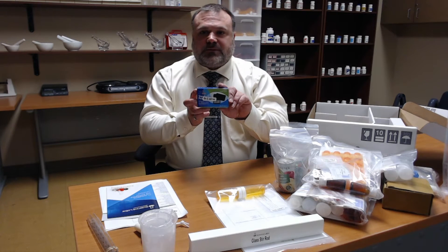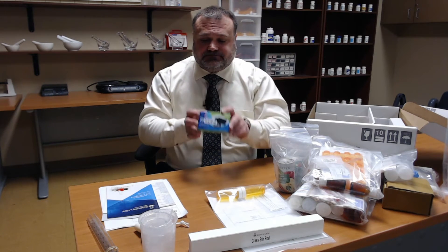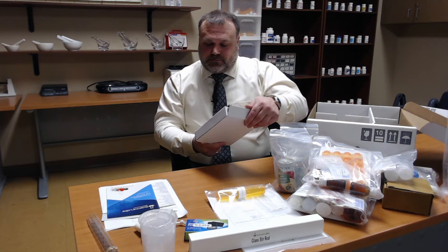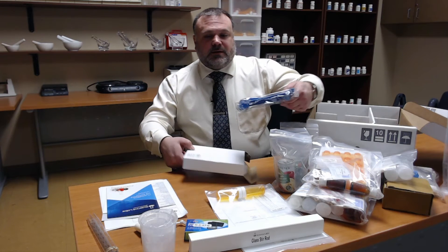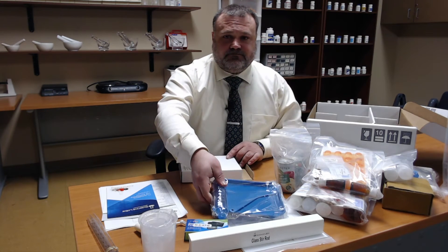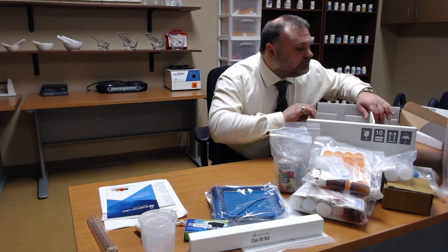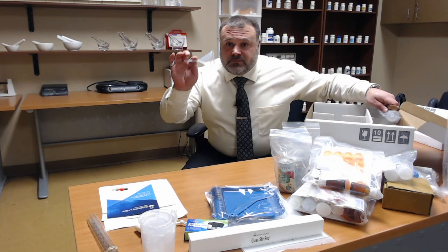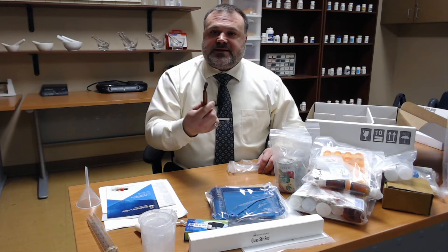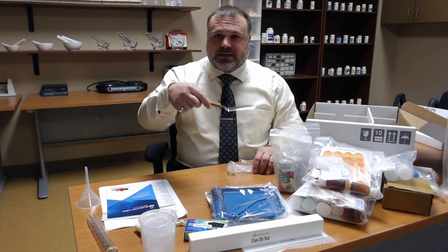This is our digital scale. You'll learn how to calibrate and tare a digital scale, and using the weighing boats or weighing paper, you'll learn how to accurately measure the medications you need to compound. This is our counting tray, utilized extensively in retail or community pharmacy where we count the medications to be dispensed to patients. We also have a funnel for pouring the liquids you'll be creating into smaller containers, and a compounding spatula for ointments — you can notice it has an angle to it which makes compounding and mixing ointments and creams a little easier.